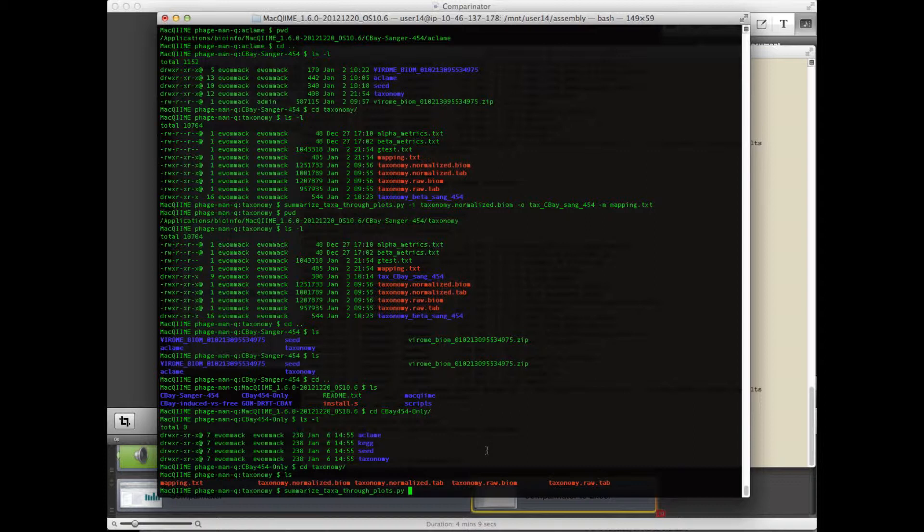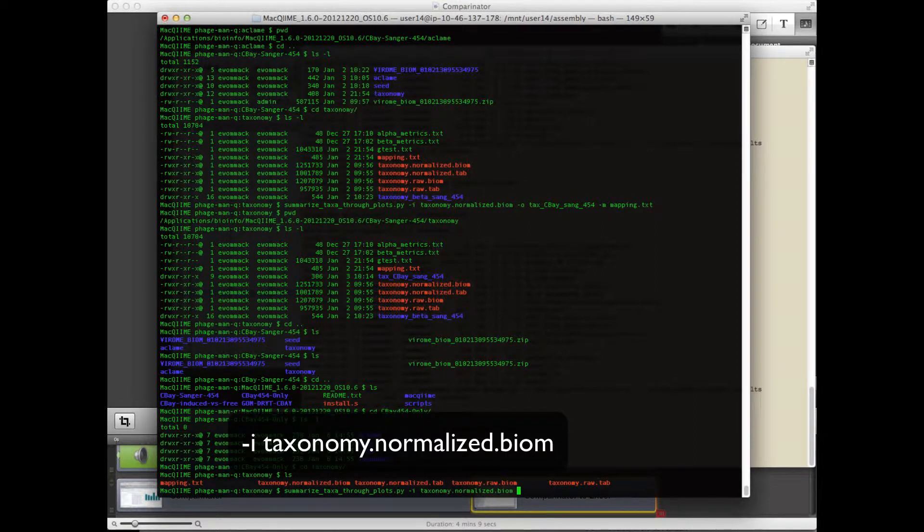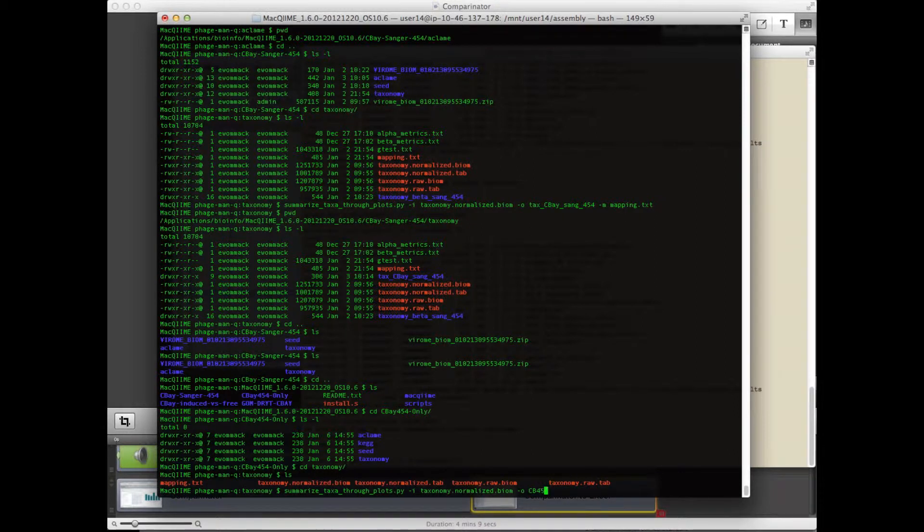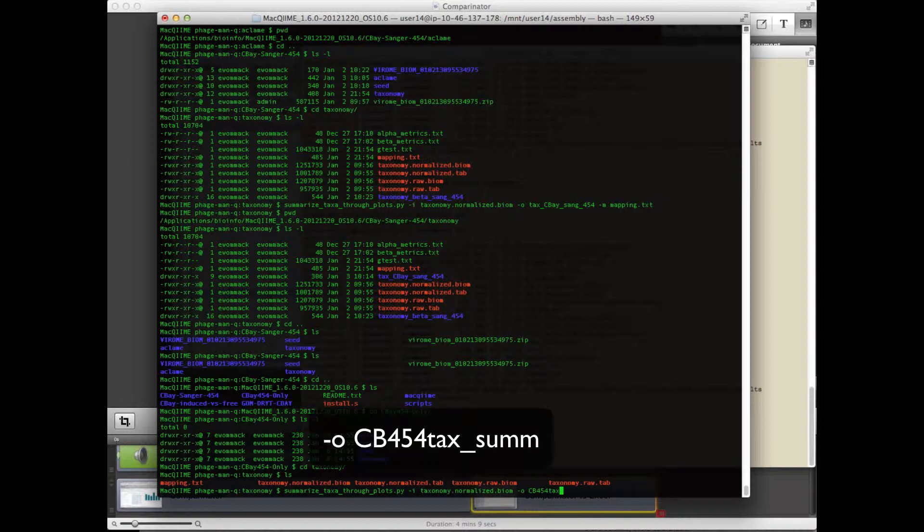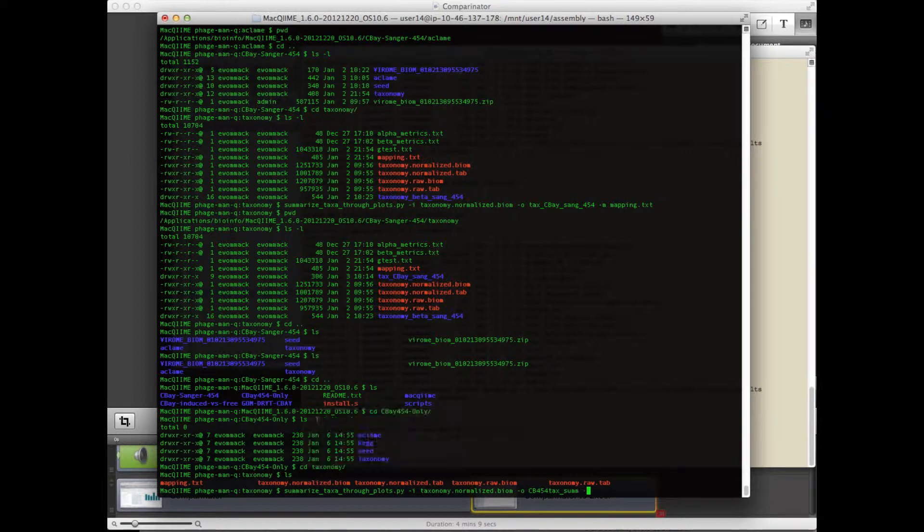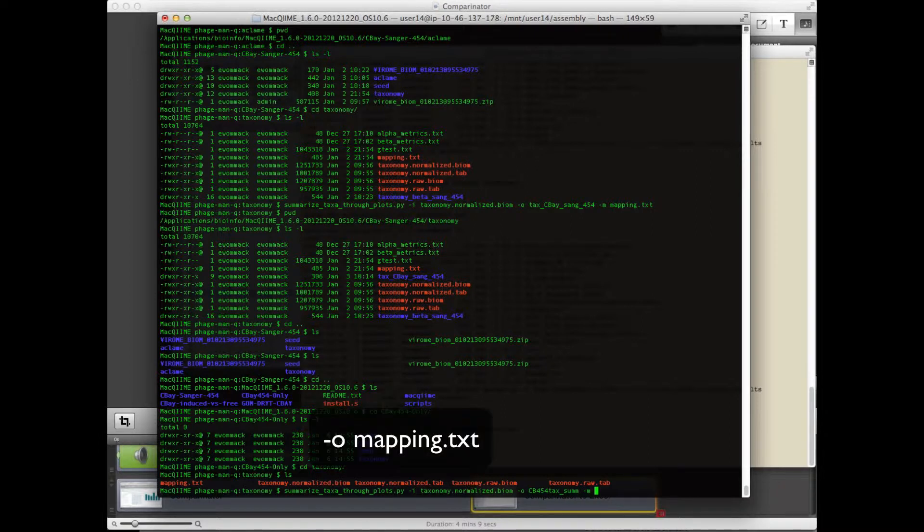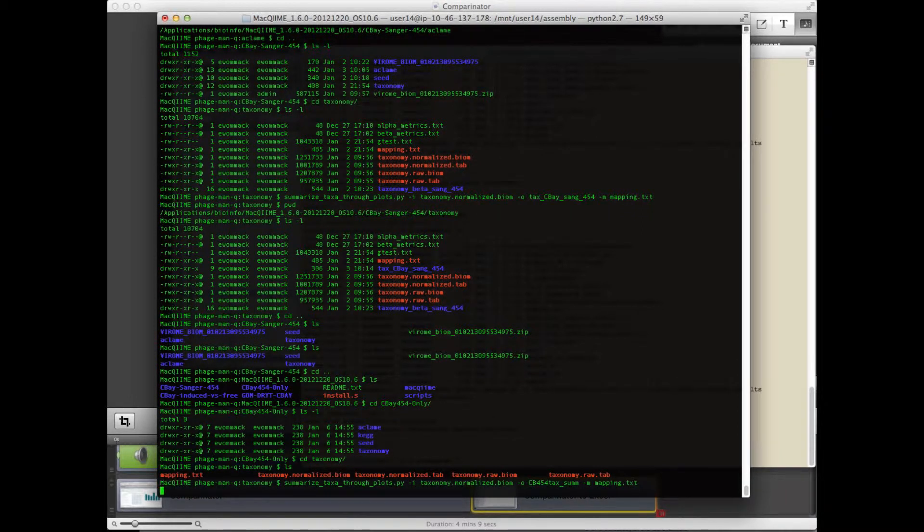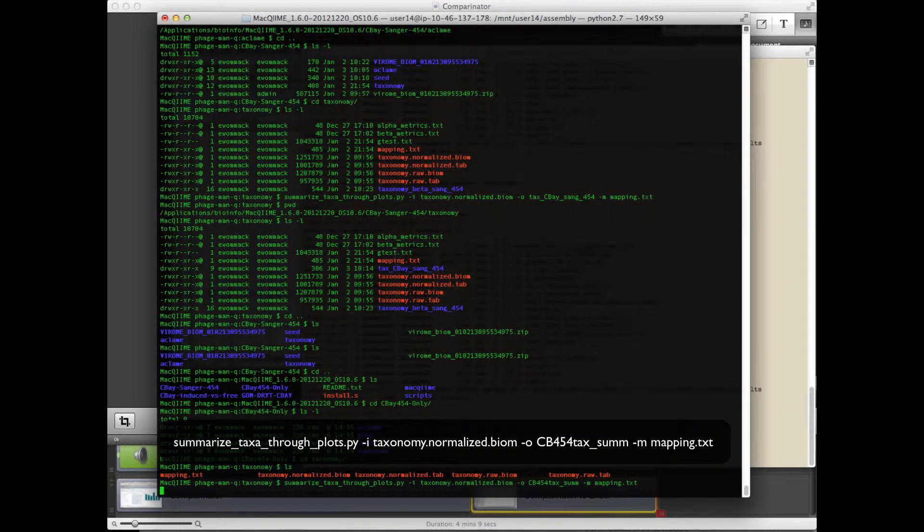I'll choose as my input file the taxonomy normalized biome file. I'll choose as my output file, give it a name. And then designate the mapping file, which is also we downloaded. And then run that script. So it'll take a moment.